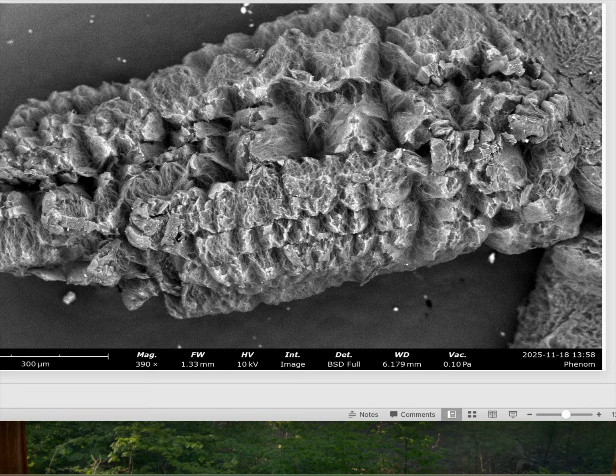And of course, we also have the graphite felt to examine, and then electro-oxidizing the surface. And we also will be applying Faradaic materials such as polypyrrole, organic conducting polymer, on the surface of oxidized graphite, followed by composites, which would include materials like this expanded graphite.